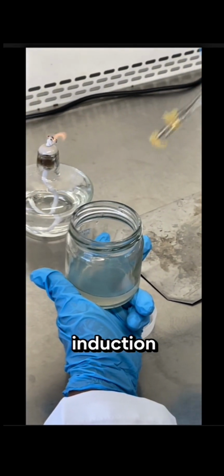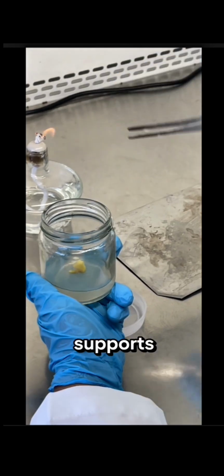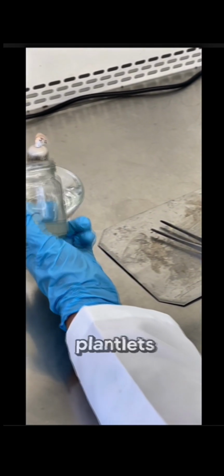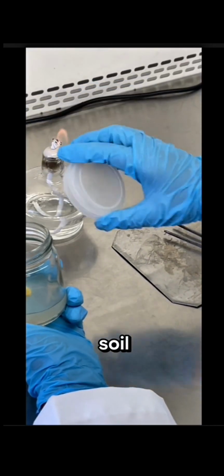Third, root induction stage. The shoots that have formed are then transferred into a different medium that supports root formation. This allows the development of complete plantlets, which can eventually be acclimatized and transferred to soil.